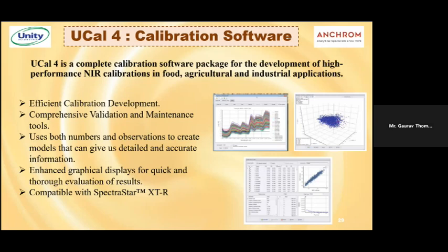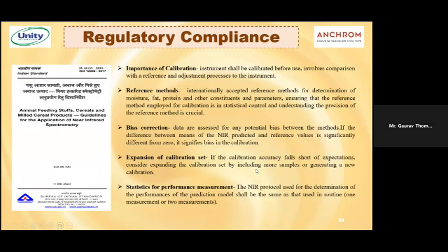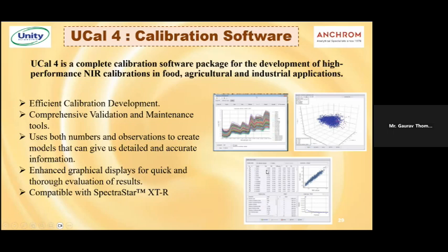So this UCal4 software uses the primary data that you feed it from the primary methods. Here is where you define your product. So for a particular sample one, this was the data for the fat and oil content.